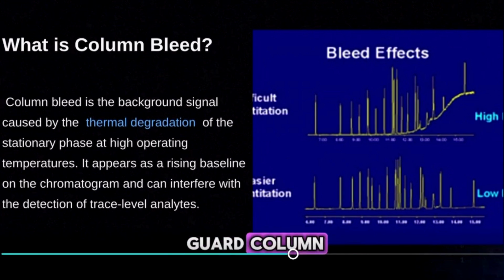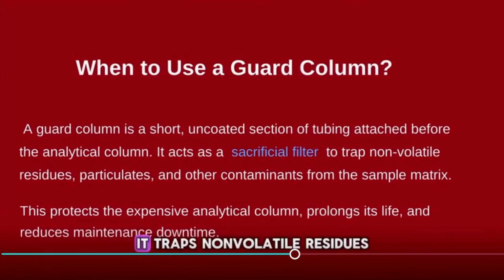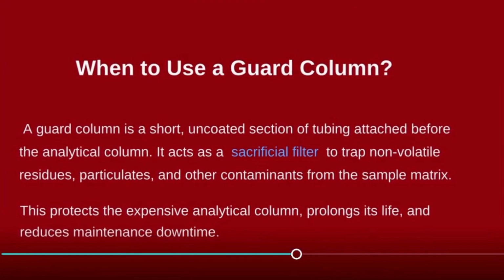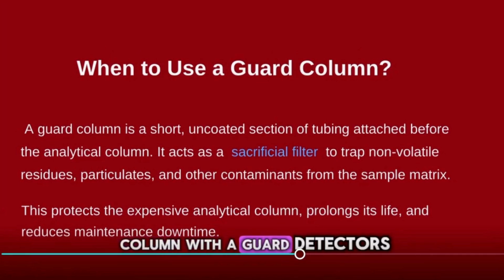When to use a guard column? A guard column acts as your analytical column's bodyguard. It traps non-volatile residues and particles before they can cause damage. This simple addition extends column life and keeps maintenance low. If you value consistency, always protect your main column with a guard.